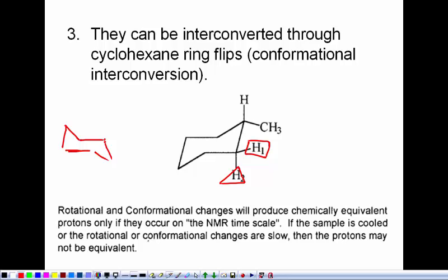So today what we're going to say is that for the cyclohexane chairs, all of them are able to flip back and forth a lot, so we're going to treat these two as if they had the same chemical shift. But there is a dynamic part of NMR where you can change the spectrum by lowering the temperature and making the molecules basically stay static during that snapshot of the instrument, which is a couple of seconds.